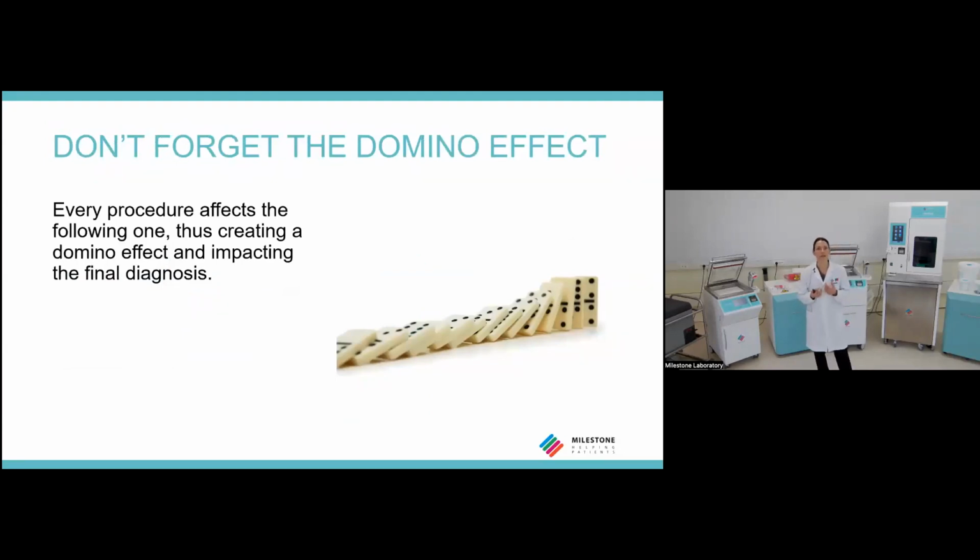Another effect, very important, is the GIGO effect. Garbage in, garbage out. If the quality of the tissue is damaged in the beginning, you cannot expect a good quality diagnosis. You can have, for example, the best tissue processor in the pathology lab, but if the tissue inserted is already damaged, the quality will for sure not be good.